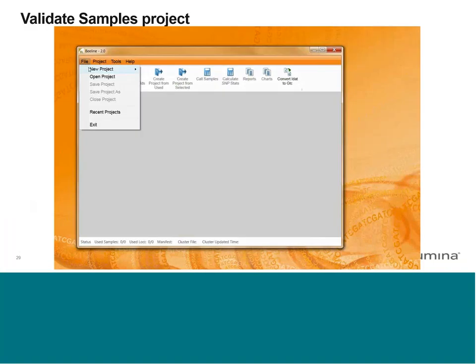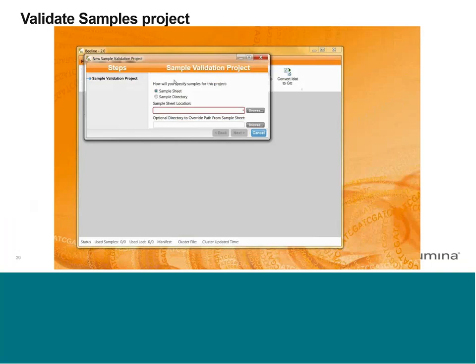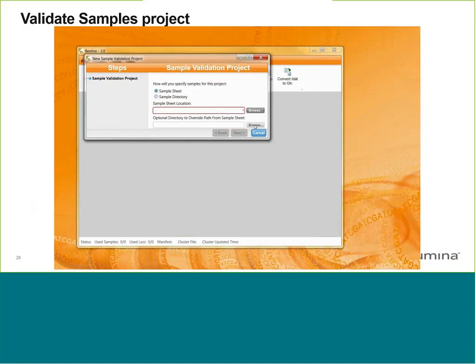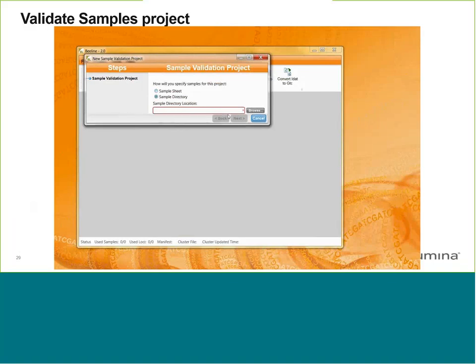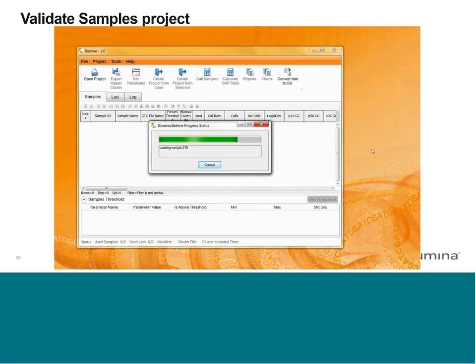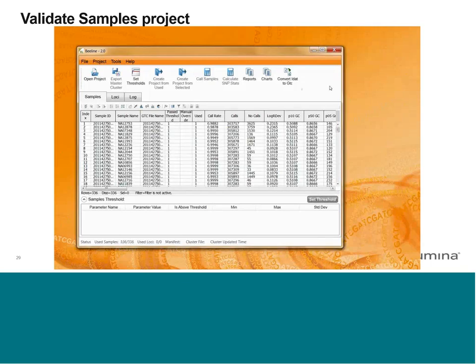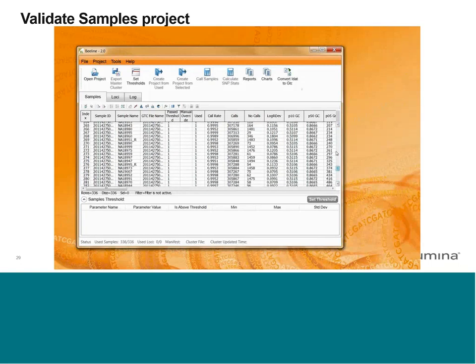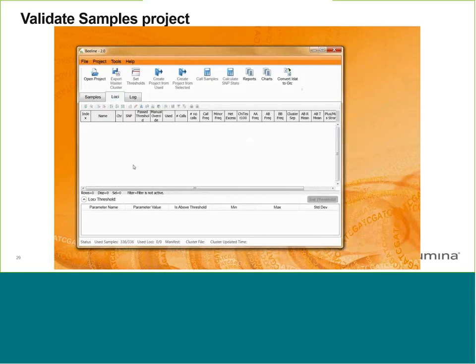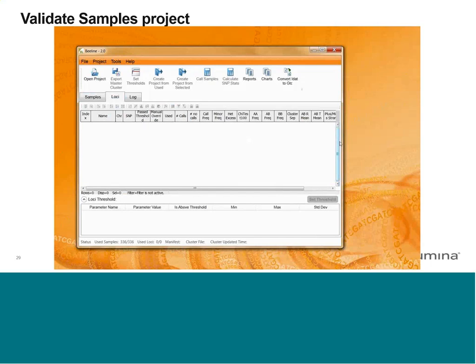A quick demonstration of the Validate Samples project: I create a project, choose Validate Samples, and load my GTC files. Once I hit Next, that's all it needs — it loads the information straight from the GTC files without including any loci information or controls information from the manifest. This allows a quick look at call rates and sample statistics for a project. The loci table is not populated because that information was not loaded. That is what a Validate Samples project looks like.